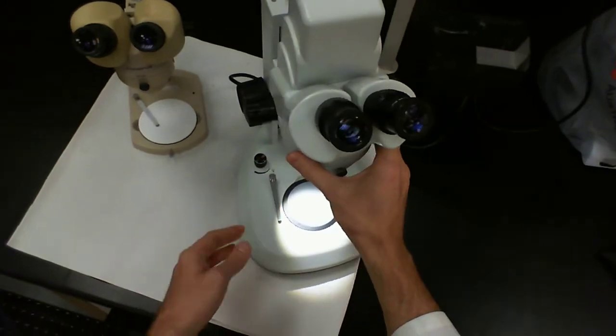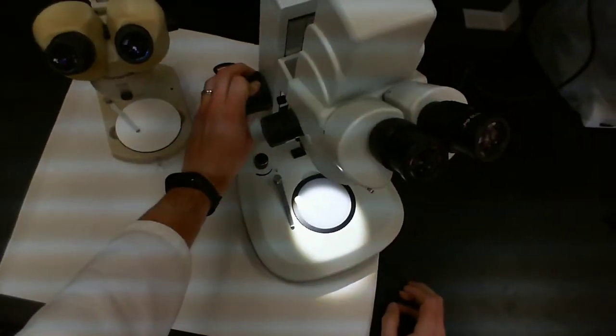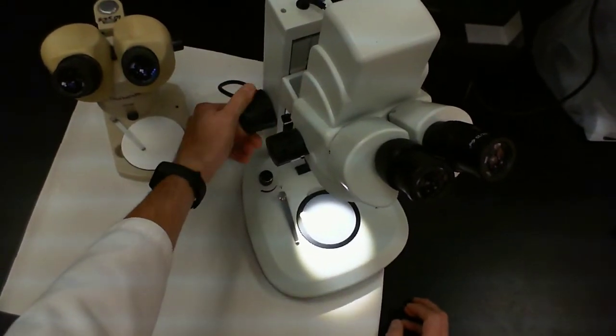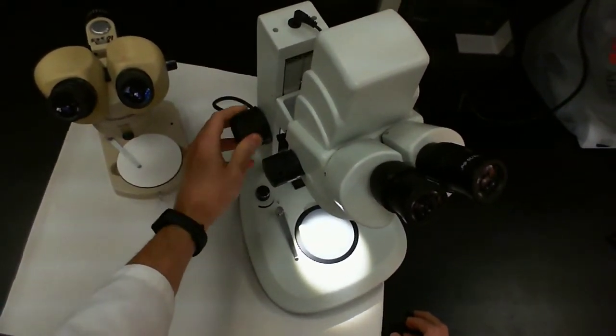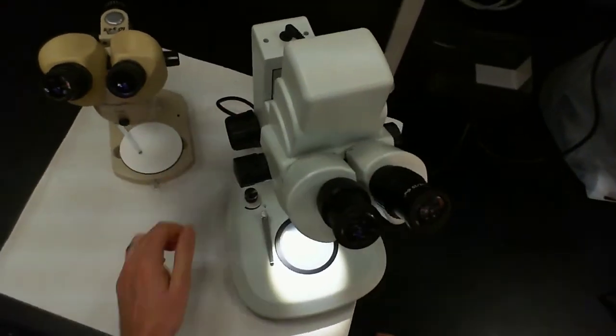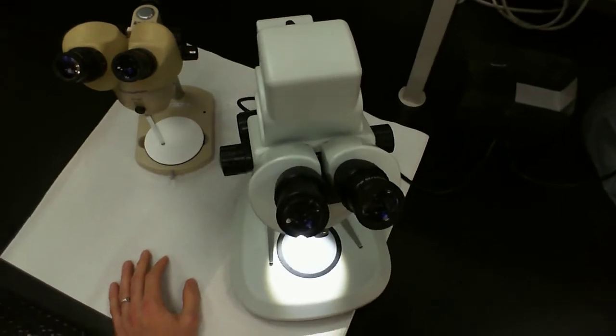We have other components on this microscope. We have a focusing knob. Just like with a compound light microscope, we do have a focusing knob, but there's only a coarse focus. There is no fine focus here, simply because the magnification we're dealing with here is much lower compared to a compound light microscope.